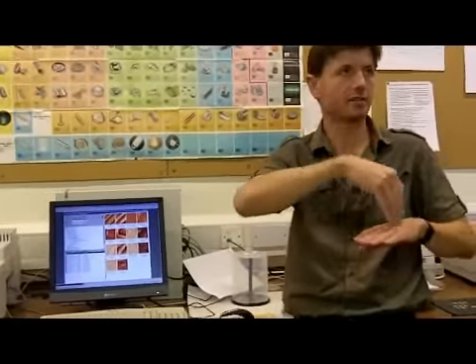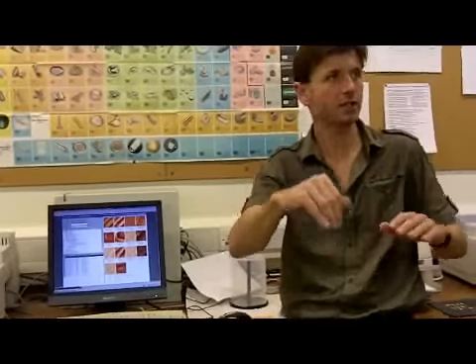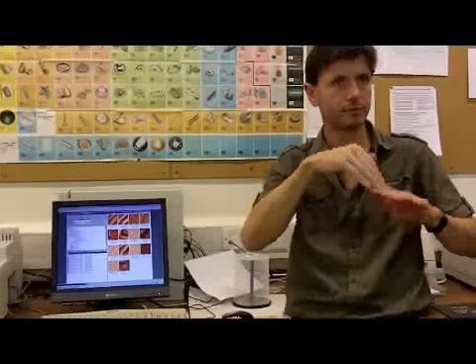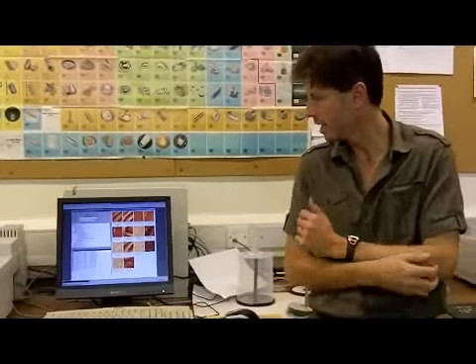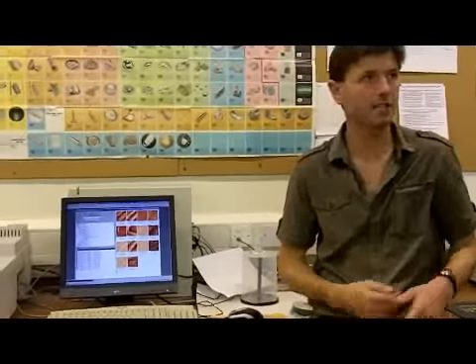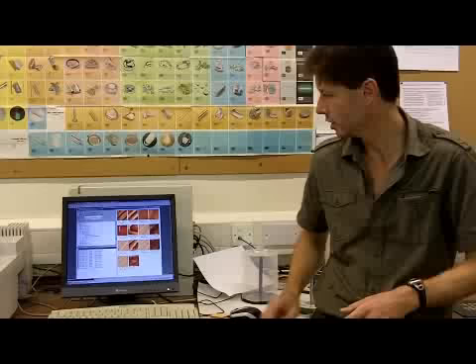The constant current allows you to measure the heights of things. You can't measure the heights on a constant height. You can only measure height on constant current. I'll come back to that point a little bit later. So what I'm going to do now is call up a couple of images and just show you the differences between the two.